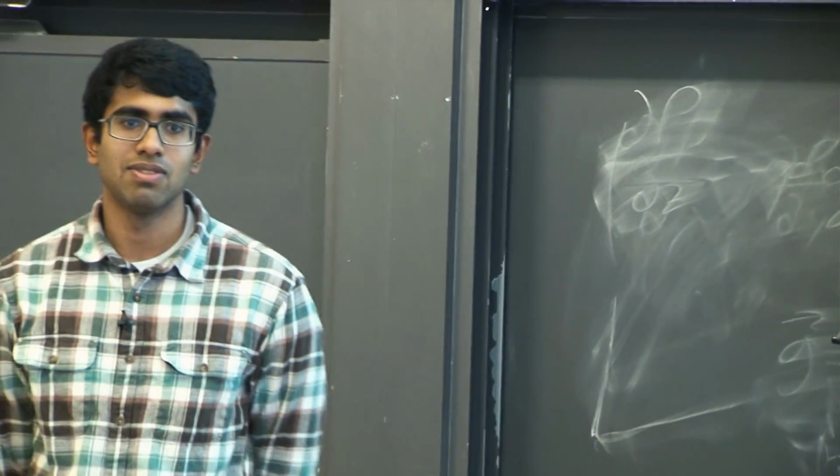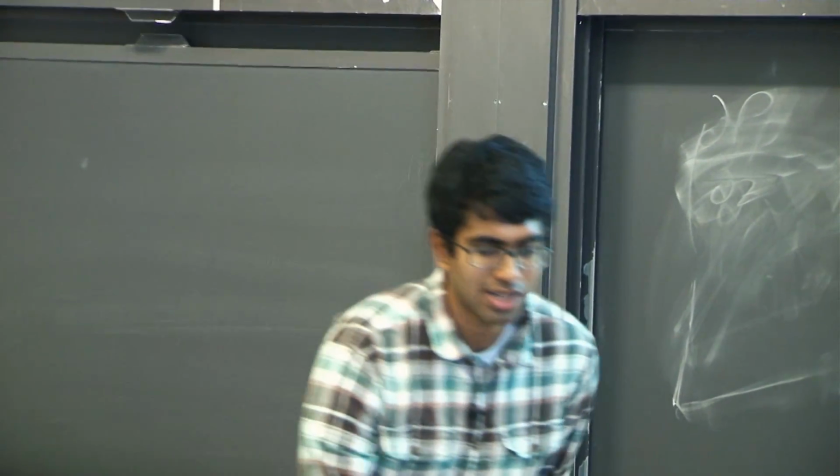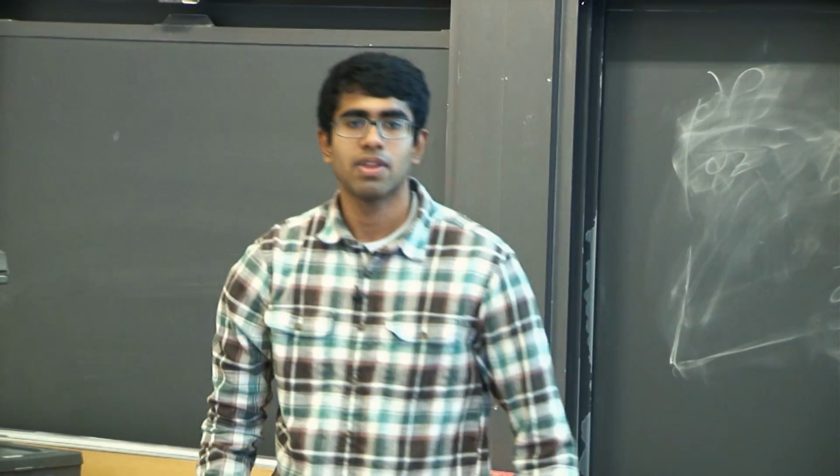Which, yeah, I heard it somewhere. Protons. Protons, yeah. So protons have one electron, and so their X-ray signal, so-called, is really, really weak. And so you can't really see protons with X-ray crystallography. And so you can't really study hydrogens or hydrogen bonds.